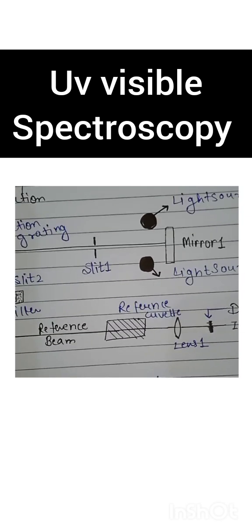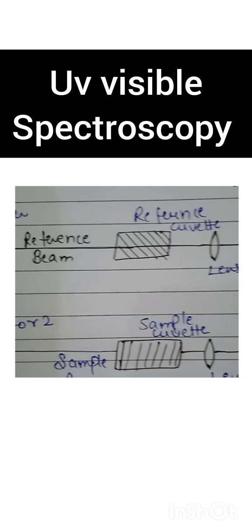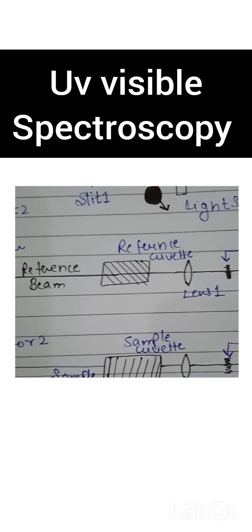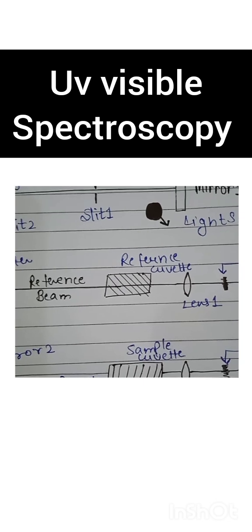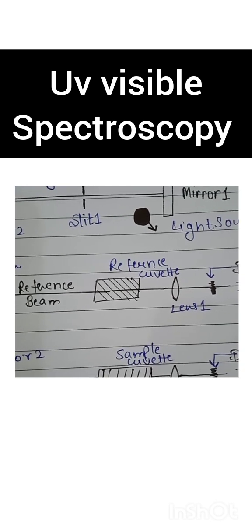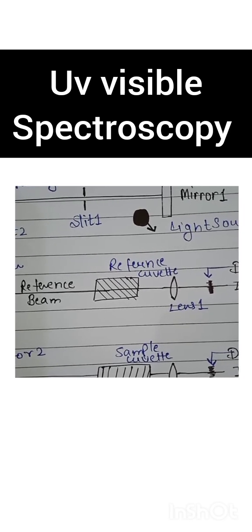Why do we use the sample cuvette? This is our sample cuvette. A cuvette is a type of sample holder for liquid samples. Often they are made of plastic, silicates, glass or quartz. StellarNet offers glass cuvettes for experiments in the visible region. Cuvettes also come in 2 or 4 polished sides.